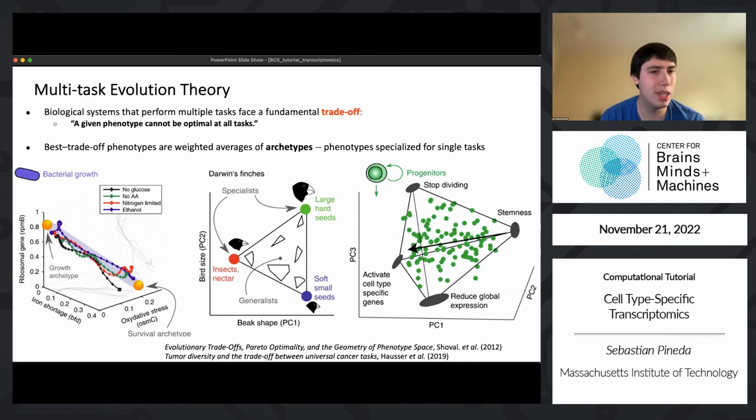well, let's put it this way. When we assign cells membership to a certain identity, we ask, what does the average gene expression profile look like for this cell type or that cell type? And is this cell most similar to that, or is it most similar to some other reference expression profile?